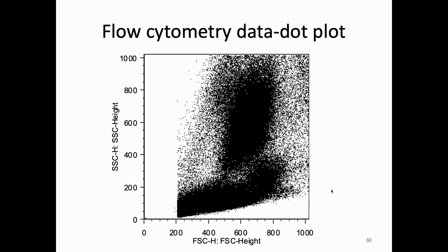Again, as a grad student, I often would do 100,000 cells, and each sample would take about 2 minutes. If you compare that to what you were doing with your microscope in lab 1, you can see how that's a big change. Our cytometer here, I don't run it that fast, but one could.